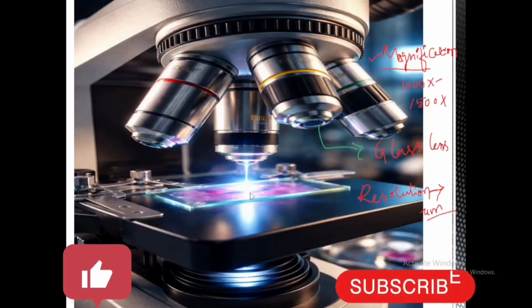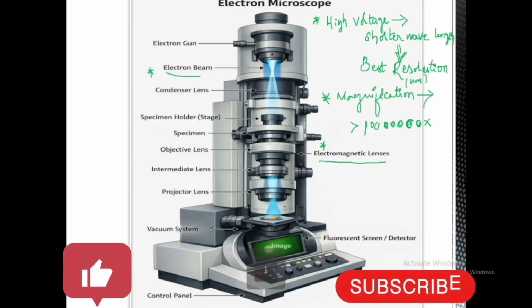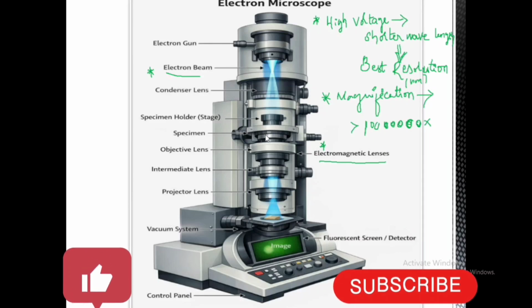The specimen is mounted in the light microscope over a glass slide. In the electron microscope, the specimen is mounted over a metal grid, and over the metal grid we mostly use copper metals. We have to make an ultra thin structure of the specimen. Then we can see the image.